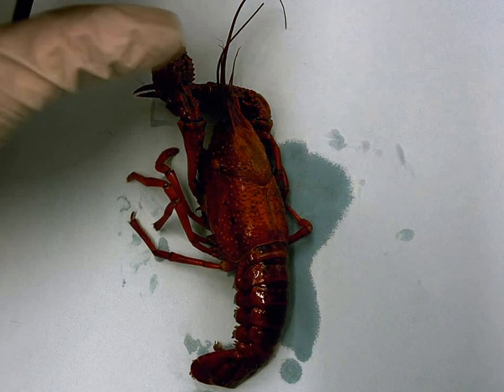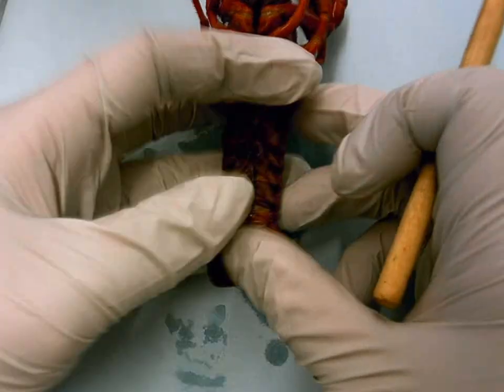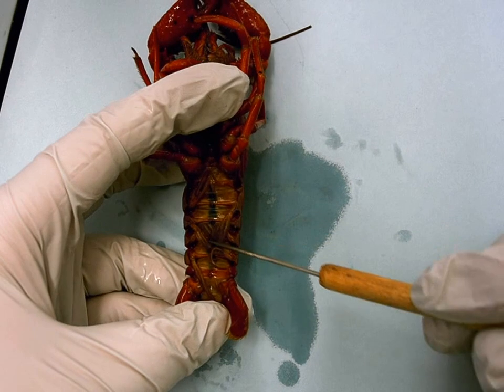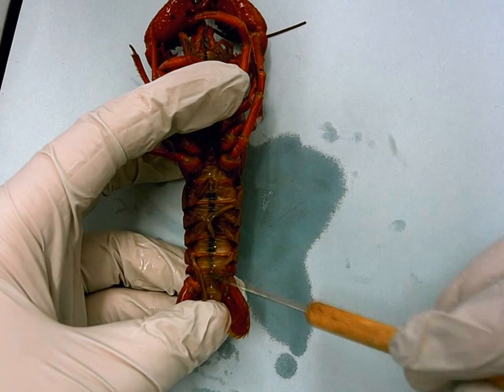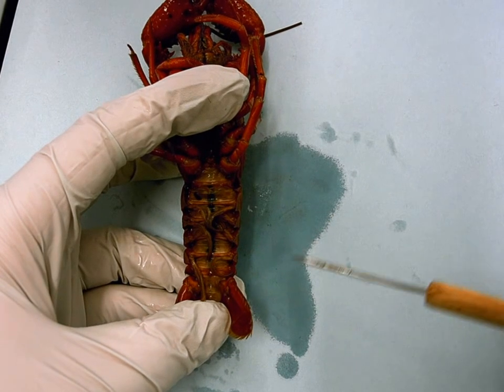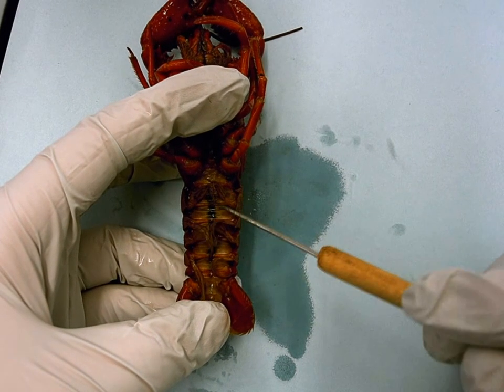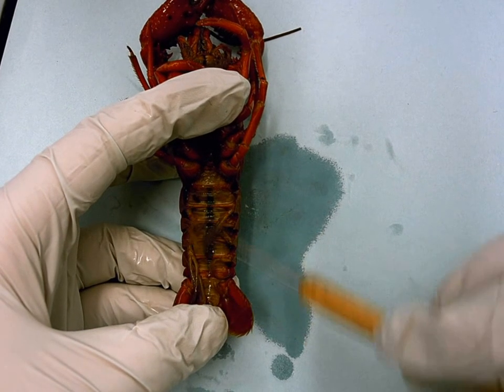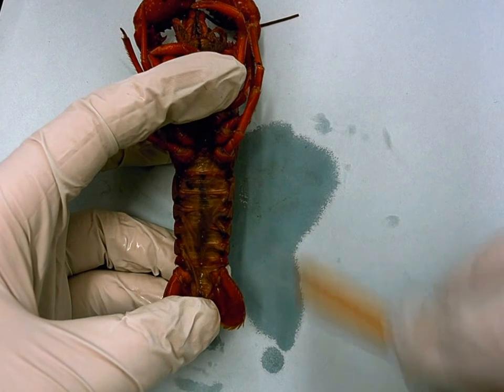In the abdomen, they want you to find the swimmerettes. Swimmerettes are on the bottom of the abdomen, which is the tail region. If we turn it over, there are all these little frilly extensions on the base — those are the swimmerettes. In males, the first and second ones would be modified to deposit sperm. In females, they're all going to be soft, large, and feathery in order to carry the eggs and the young as they develop.